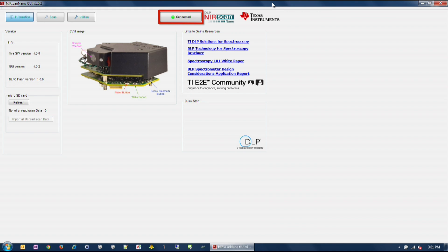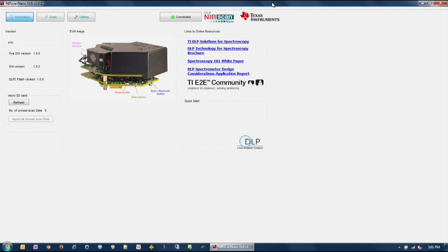It also has three GUI navigation buttons: Information button for status and help, Scan button to display spectral data, and the utilities button for system settings. The lower section displays information related to the three buttons: Information, scan, and utilities.